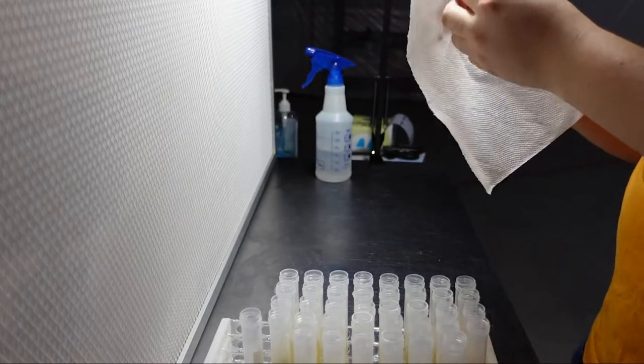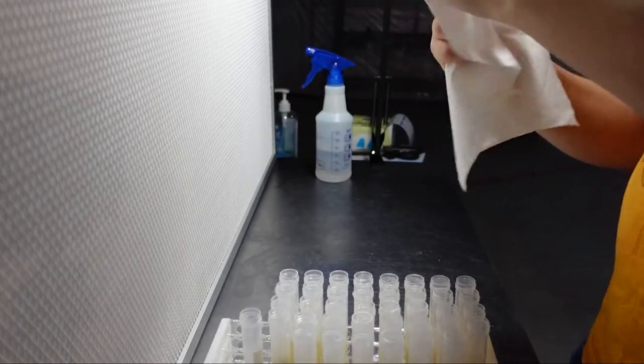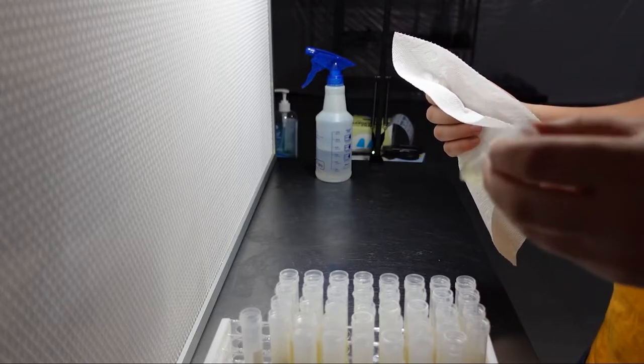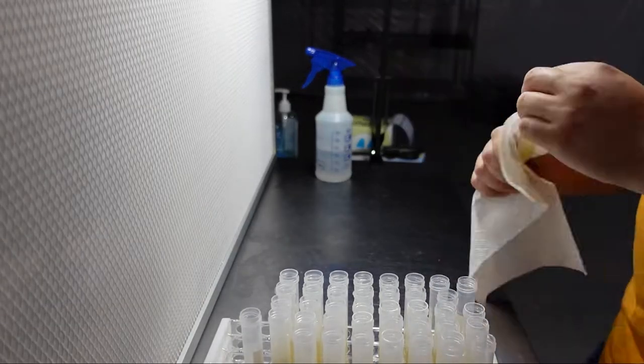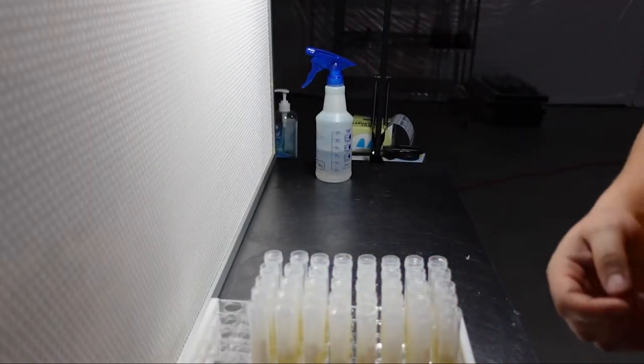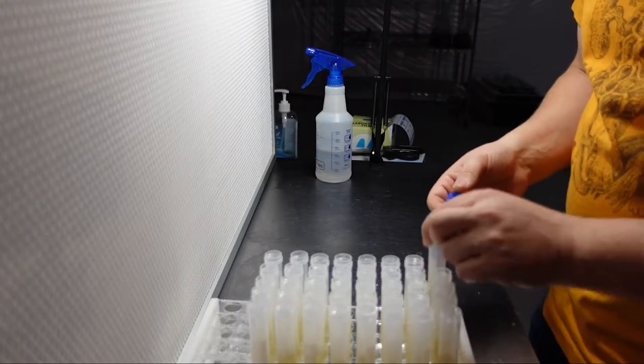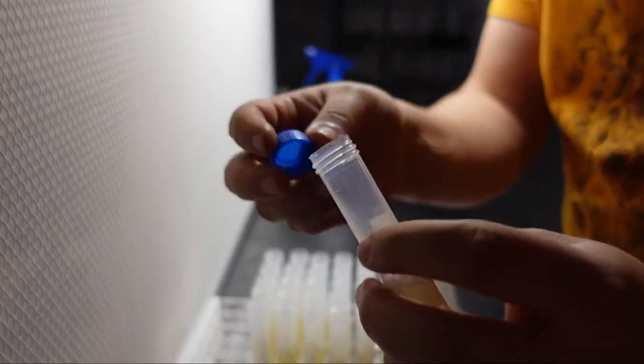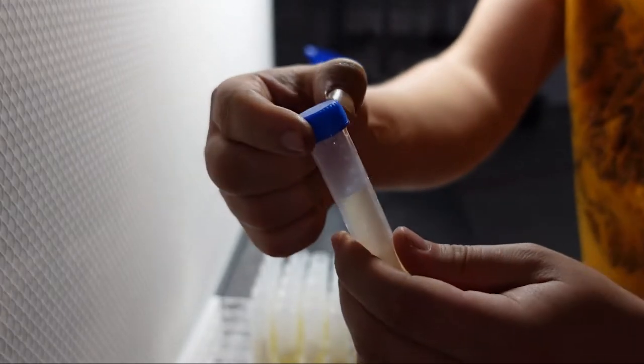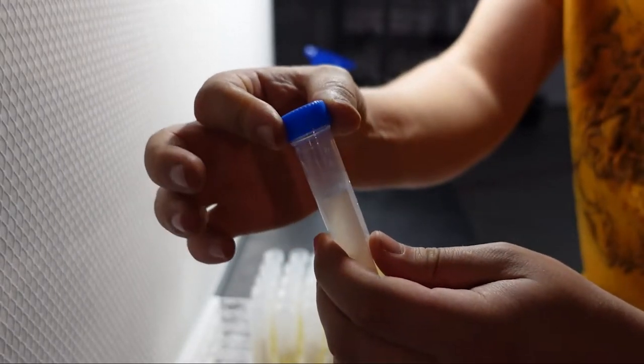Once all the tubes are filled, I like to go through and wipe down the sides and tops with a paper towel, in case I spilled some media on the sides. Now that the tubes are wiped off, I'll go through and loosely screw on the lid to each tube. You'll want to make sure that you don't tighten the lid all the way down, as this could cause the tube to break during the sterilization process.